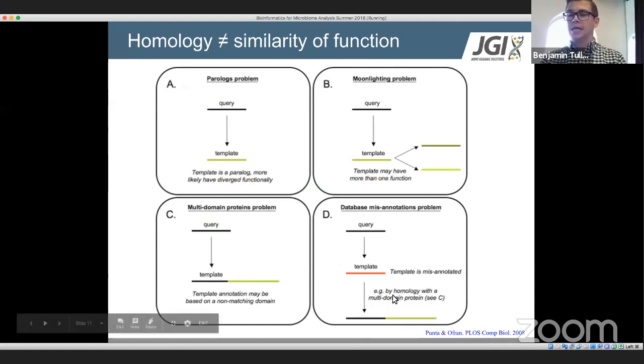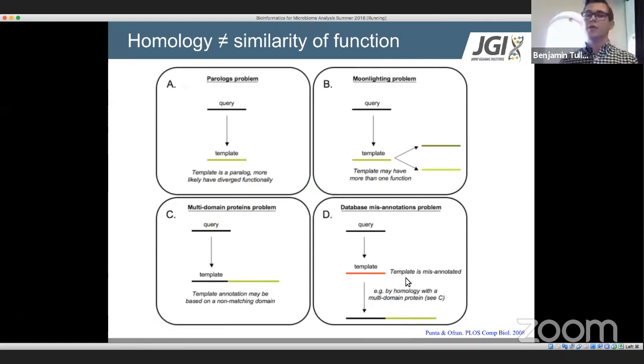And then last but not least, and this is one of the really bad downsides of a public system, a tragedy of the commons situation, is that the template that you match to might be misannotated. We relied a lot of time on people looking at these sequences and going through. And so if there's an error that was made someplace back in time, and no one's ever corrected it, that error will just continue to propagate in the database going forward.